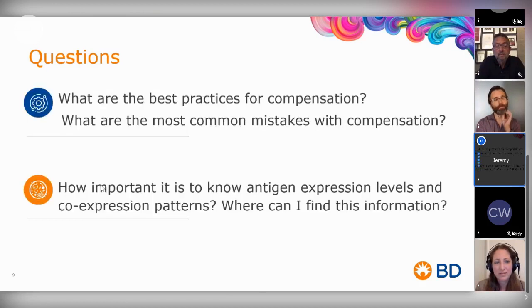So our next question, why don't we direct it towards you? What are the best practices for compensation, and what are the most common mistakes with compensation?